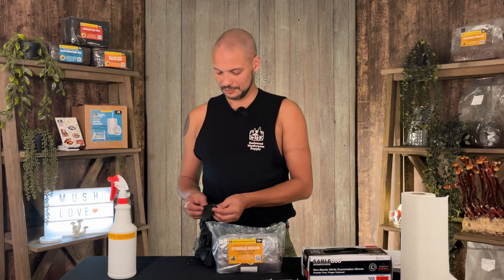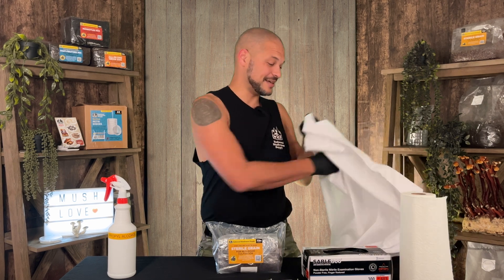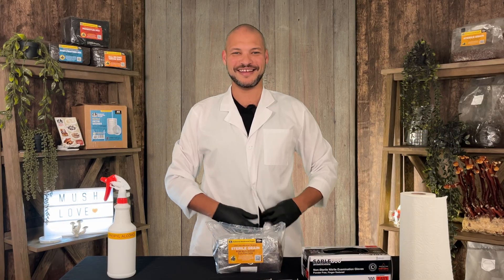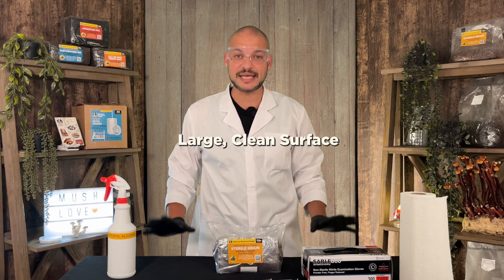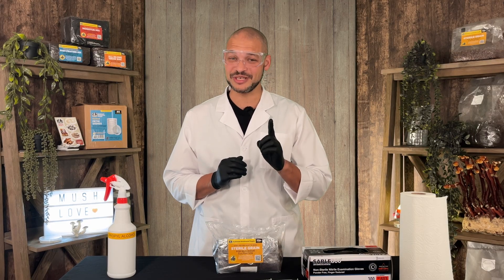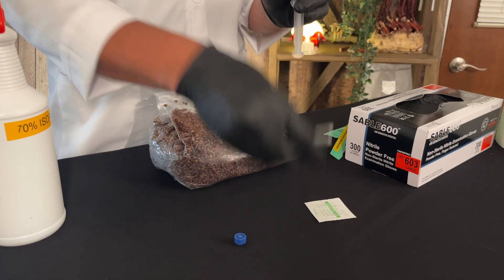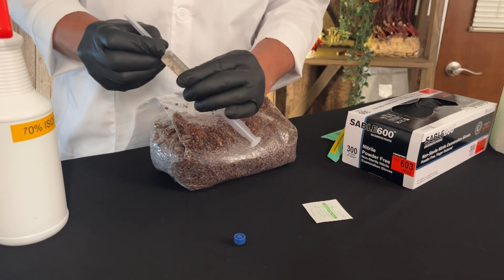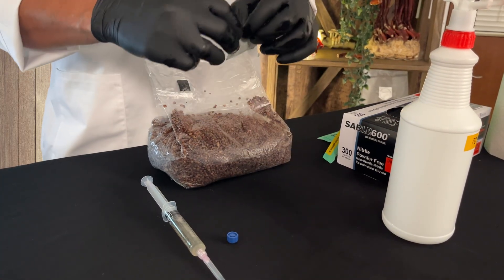Let's prepare our inoculation area. Make sure you have the following: disposable gloves, 70% isopropyl alcohol, paper towels, a lab coat, and eye protection. You will also need a clean tabletop or hard surface to work on. Lab coat and eye protection are optional but make it a lot more fun. Use a sterile needle for injecting liquid culture. Cleanliness is crucial — always sterilize your workspace, tools, culture packaging, and grain bag before inoculation to prevent contamination.